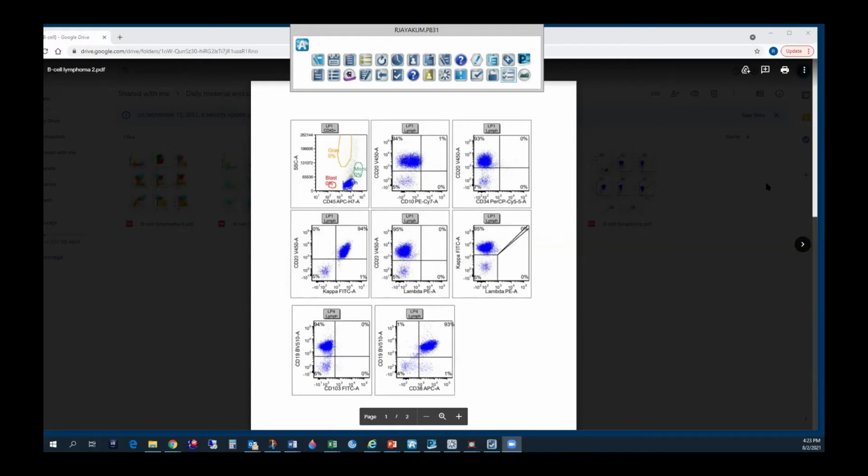We never gave individual numbers for antigen expression, and at MSK as well we would just mention all the antigens that we did. Here I have seen a long list where you have to put each and every antigen percentage, which I feel is not needed, and it's kind of, I should not say this, but bullshit. So I stopped doing this and asked them to stop too.